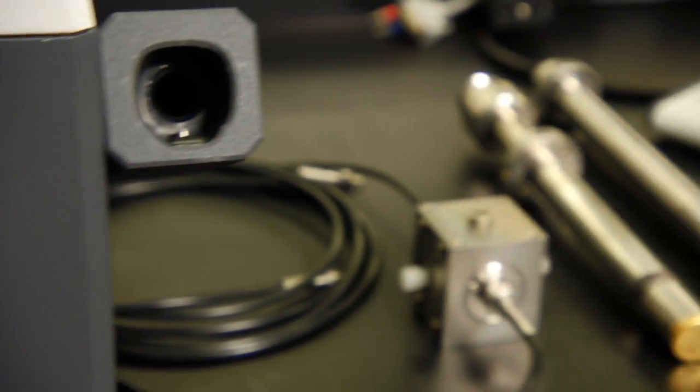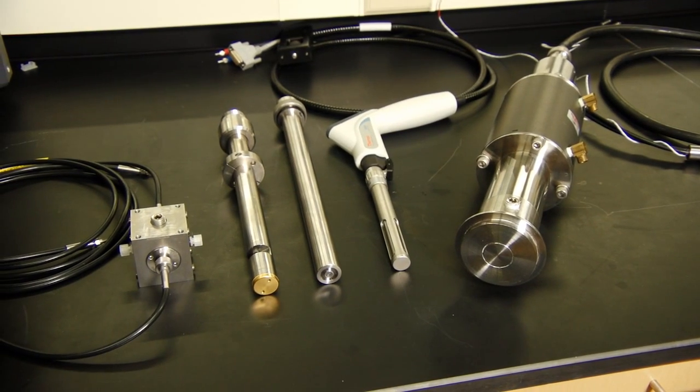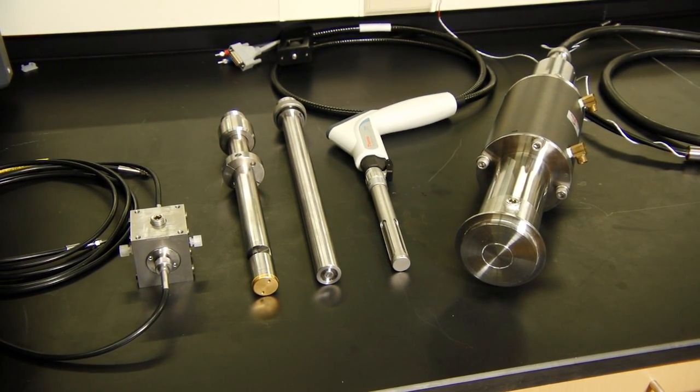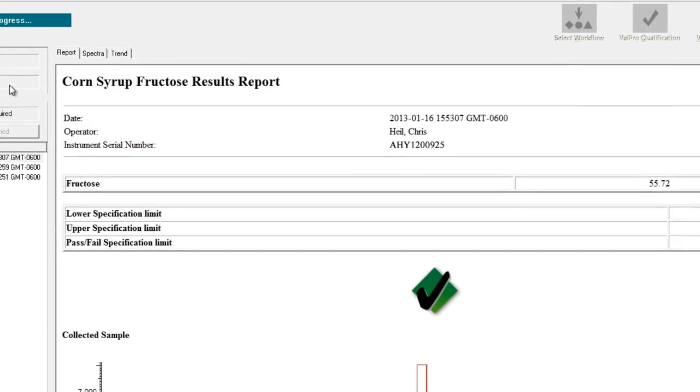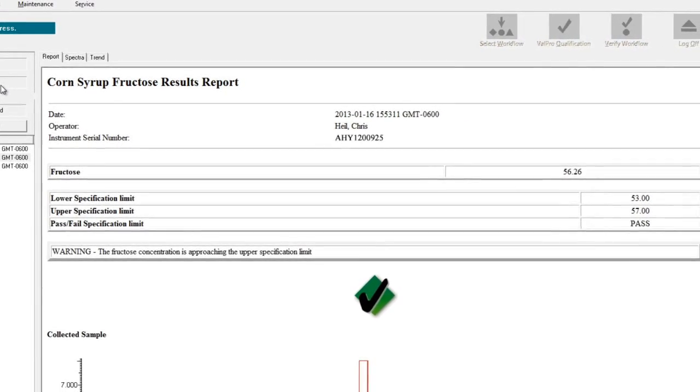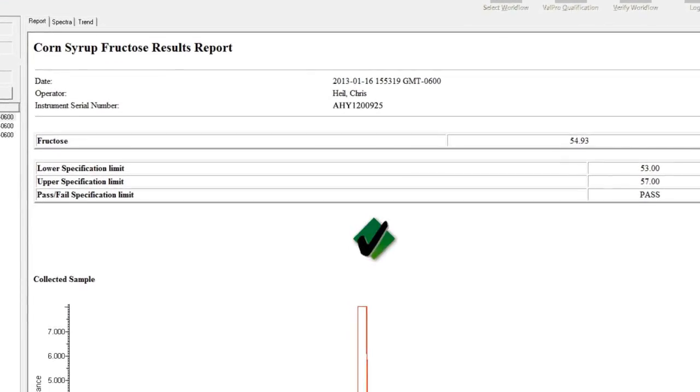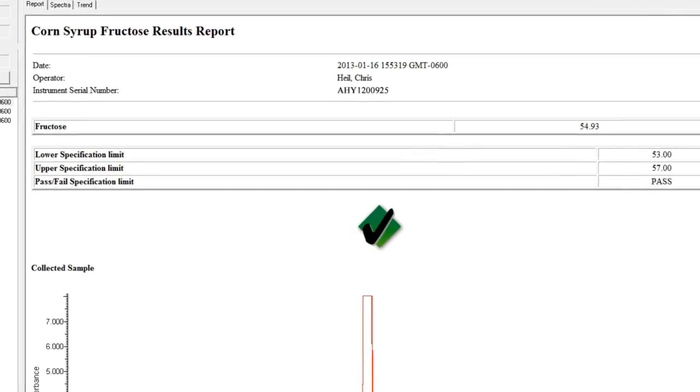Industry standard SMA fiber optic connectors assure quick and easy use of third-party probes for online analysis, such as monitoring carbohydrates in corn syrup directly in production processes, to warn if a measured component is approaching a specification limit, has gone out of spec, or has been manually or automatically corrected.